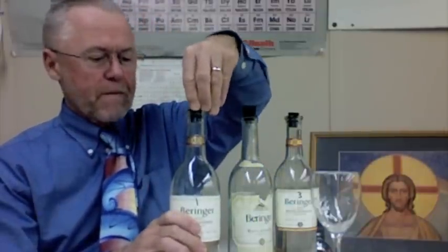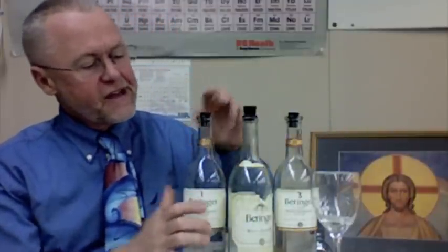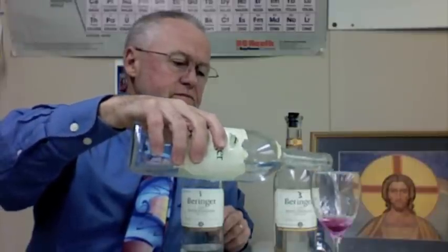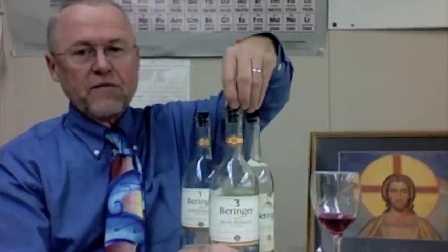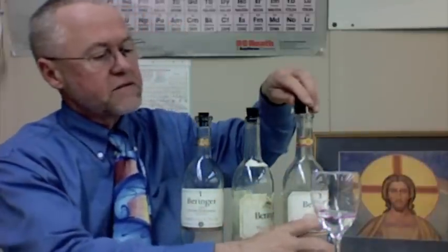So, here's some rather plain-looking water here. And here's some more water. Watch carefully. There's our water into wine.